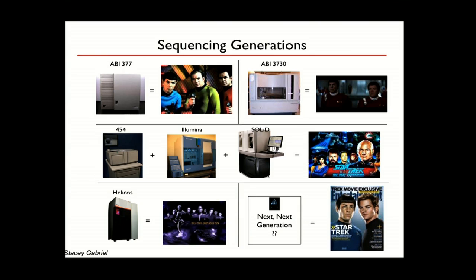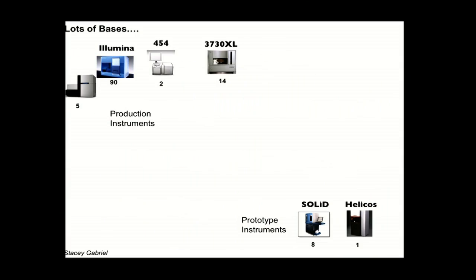And finally, there's these next generation machines. It's unclear. I hope they're not called next generation from now on. I think they'll probably be 3rd generation machines. There's things like the Pacific Biosciences machine, Nanopore, Ion Torrent. These are machines that have, I think, potentially radically better capabilities than those next generation machines, but are not yet at the scale of either 454, Illumina, or Solid.